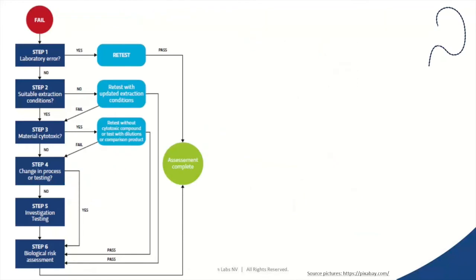Yeah, I think that's what we have seen also within extractables and leachables testing. If you say this product doesn't contain a certain plasticizer, or in polymer manufacturing, they're using something else. They add a plasticizer for the right reason. It has its reason why it's used.